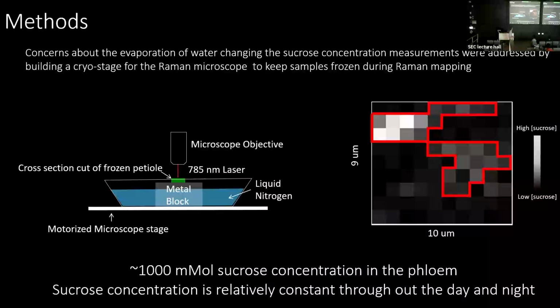So we had samples of oak leaves that were collected across 24 hours. Some poor grad student had to go up in a forklift every hour on the hour and sample a leaf and then snap freeze it for 24 hours. And then they brought that into lab. And we wanted to know what the sugar concentration was. So we had to do everything frozen.